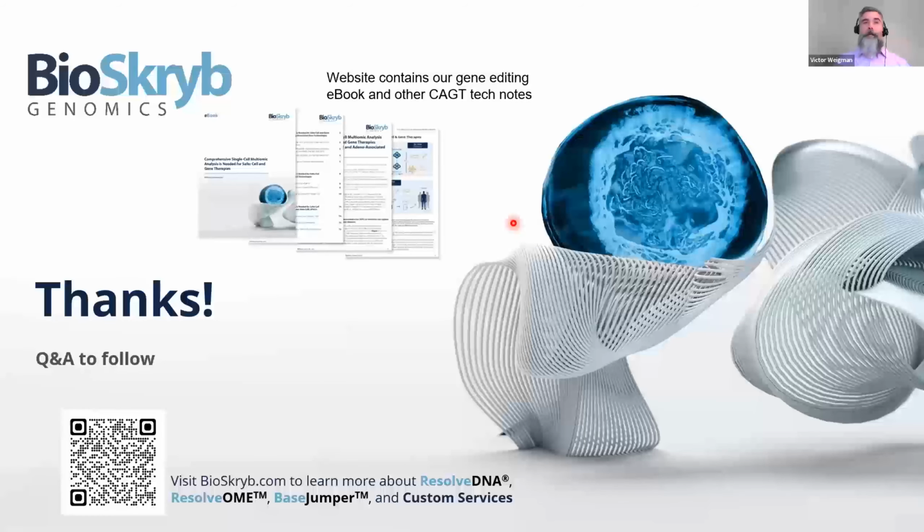That's a great question. A couple of different ways to answer that. Number one, yeah, bulk sequencing. If you're working in a cell line based in vitro, or in organoids, you're going to identify the major events happening in that edit. I mean, you just are. That's just the statistics of the genome copies you're measuring.